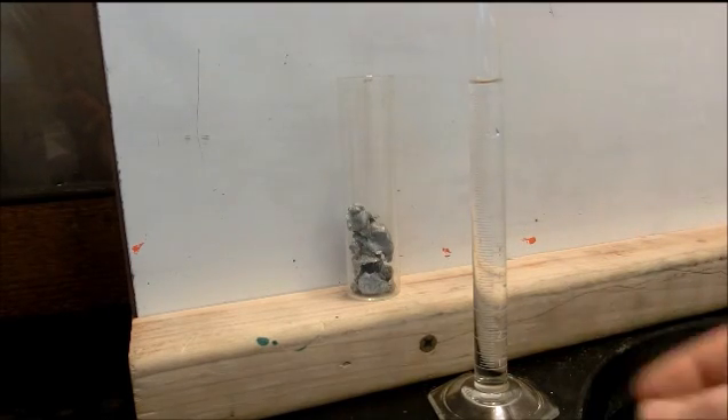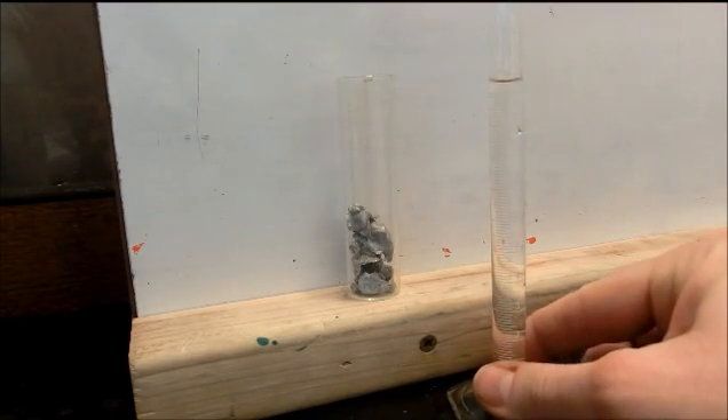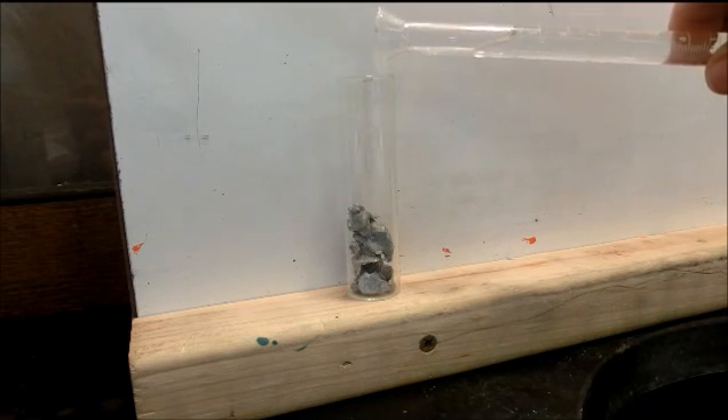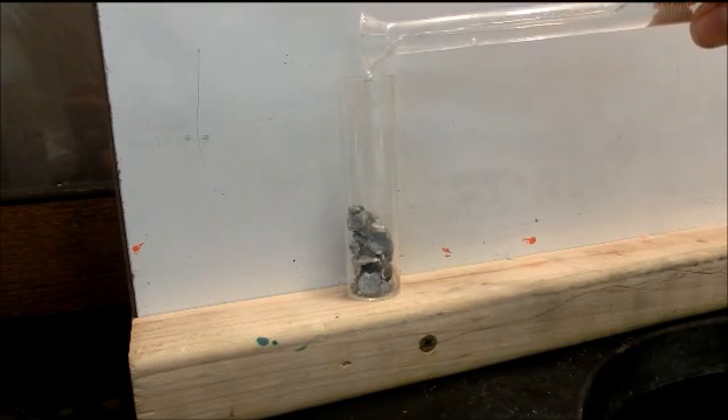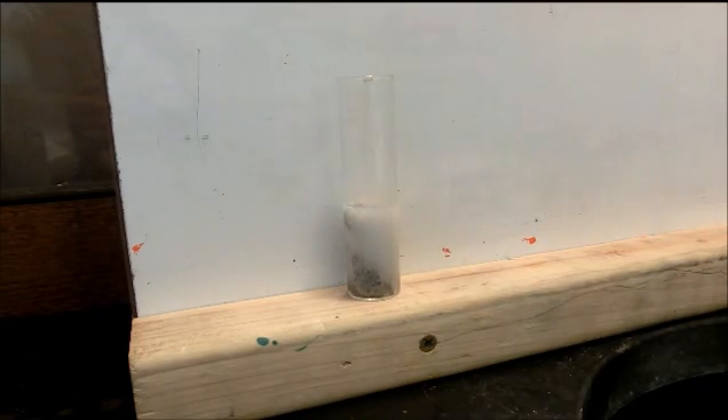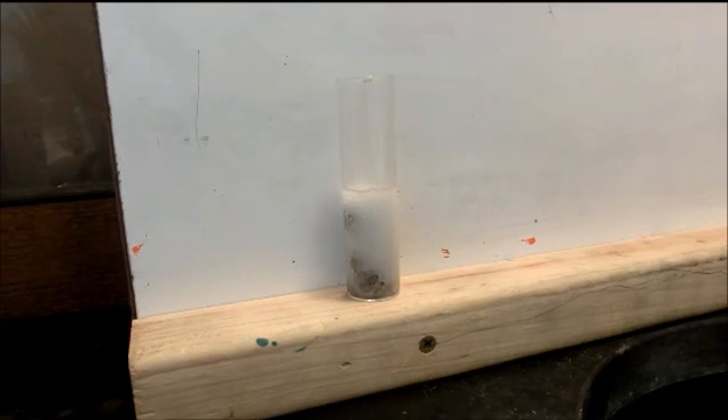We have the sample of zinc inside of this tube, and we have hydrochloric acid in the graduated cylinder. Pouring the hydrochloric acid carefully onto the zinc — you will notice that there is an immediate reaction. Gas is being released and that's going to bubble for quite a long time, so we are going to let that sit overnight.